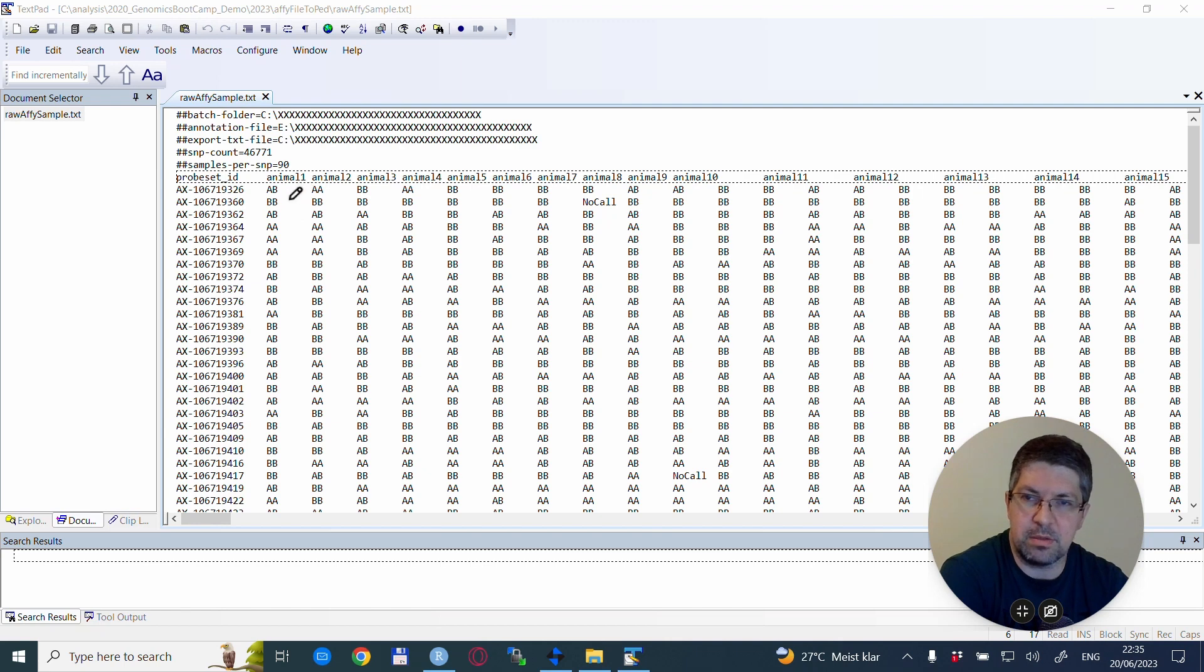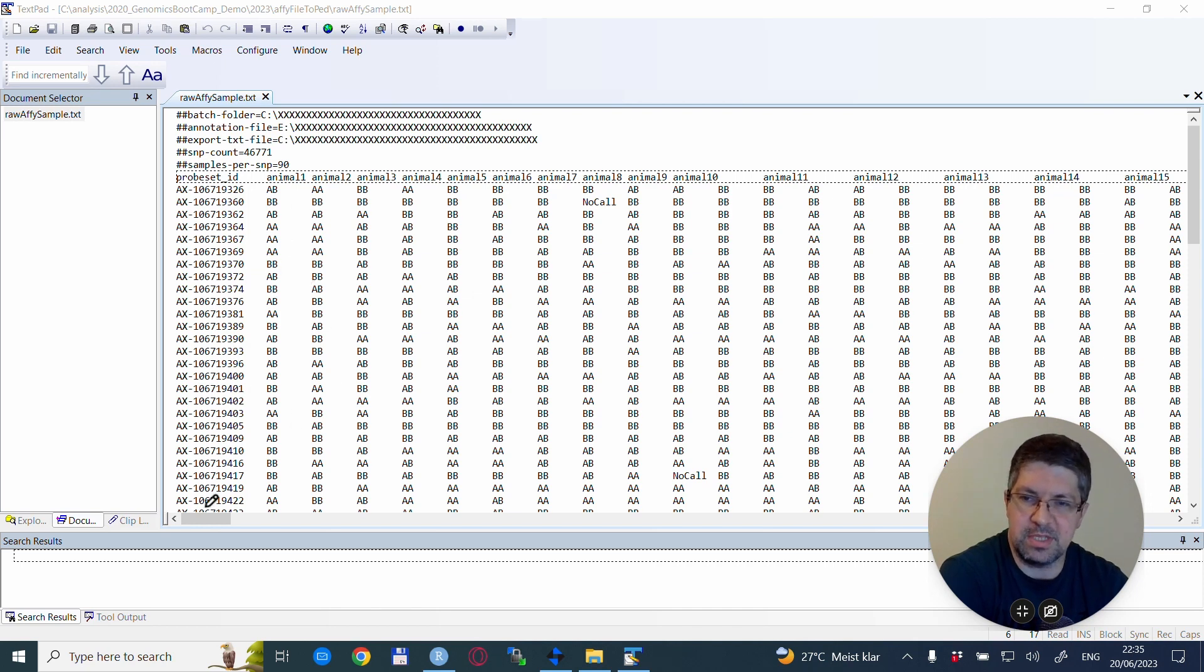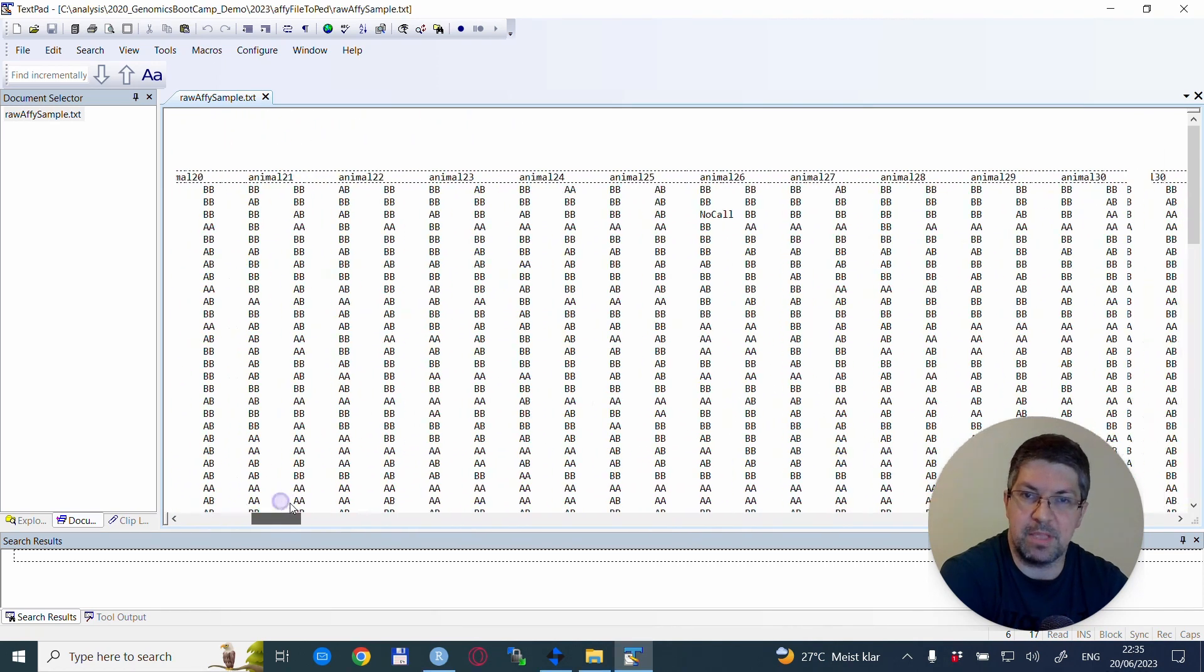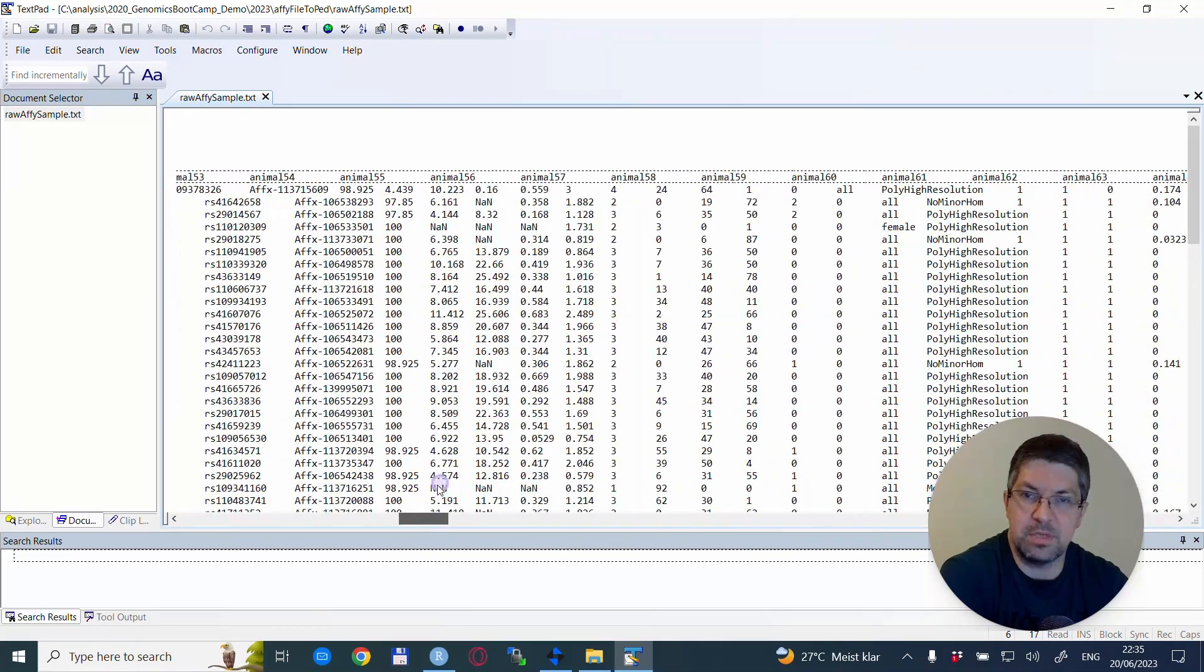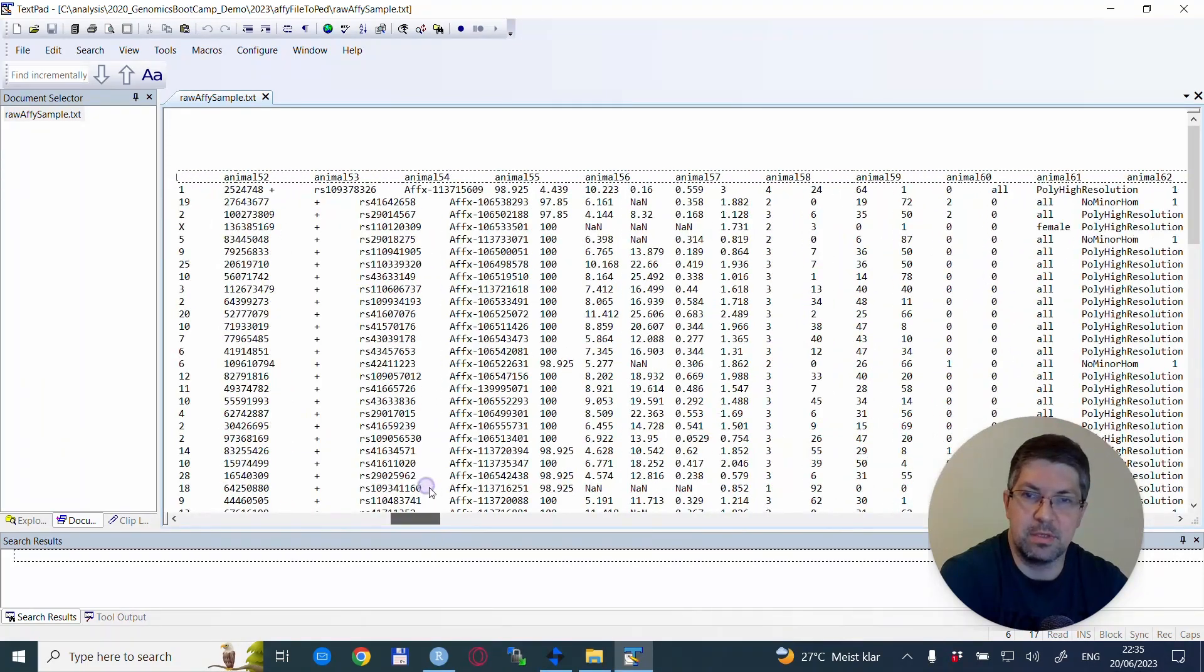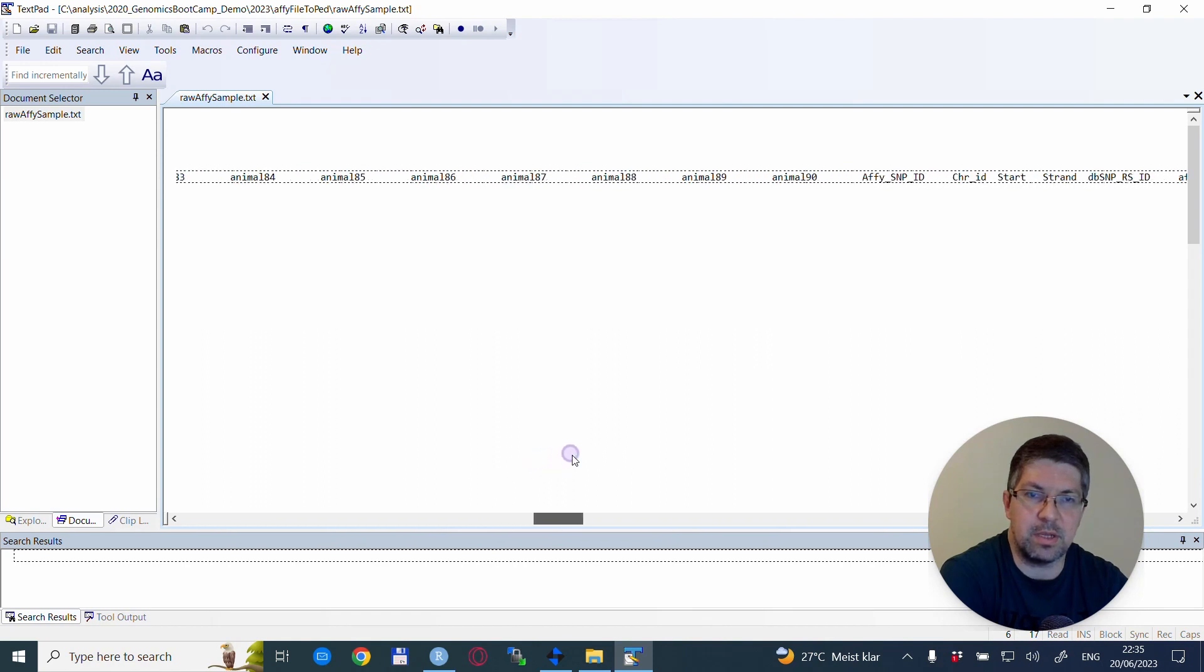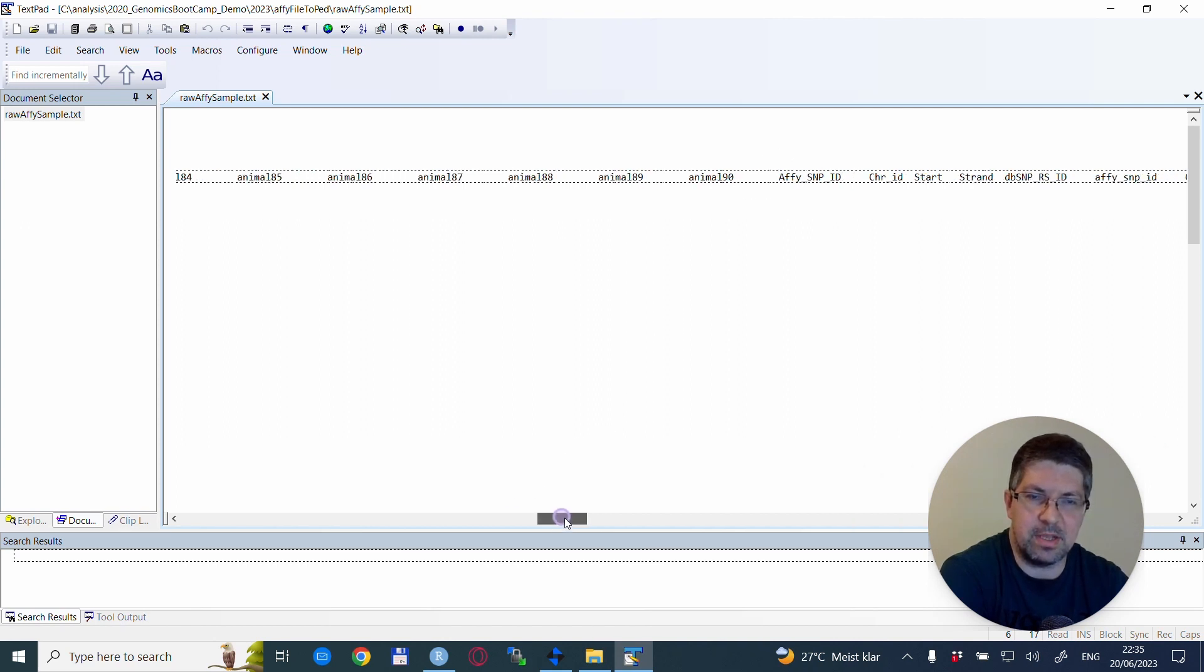The genotypes are in this case in an AB format, and they are written together without a space. So this file has quite a bit of columns, as you will see. It has 90 animals. We are here—okay, so this is animal 90 in this anonymized form.